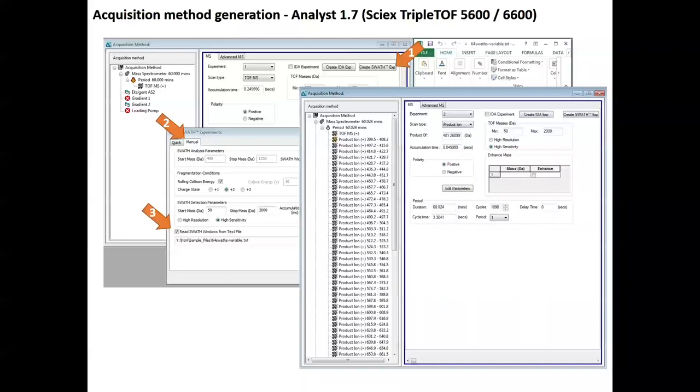Yeah, so this is a legacy from the first analyst. It's not a random mass, it's actually a mass inside the isolation window that the software still uses to calculate the borders. If you do a PRM type experiment, this would be the mass of your targets. But in DIA, in SWATH, it's not really meaningful for you. What matters is really these borders here. If you use a very old type of converter, sometimes this mass is still referred to. But in practice, most of the converters now pick up the window width directly.